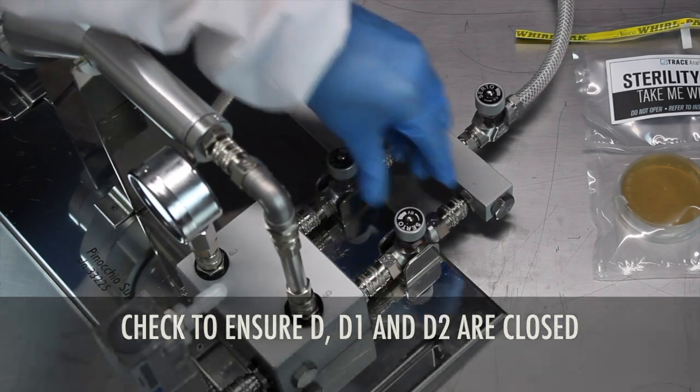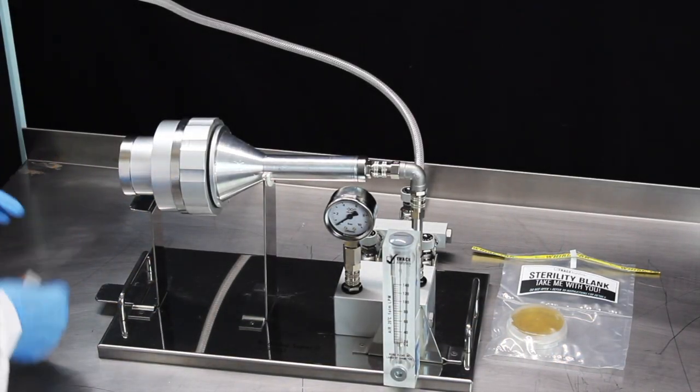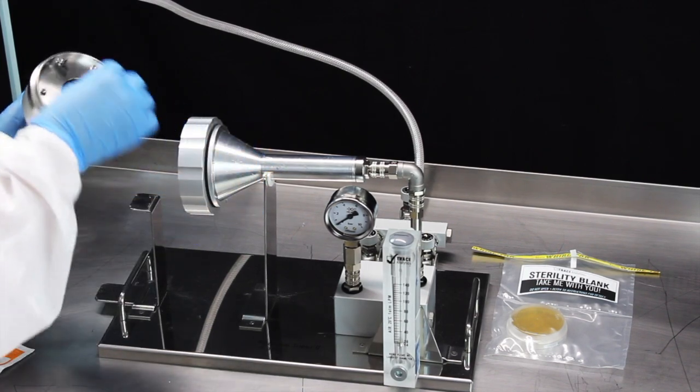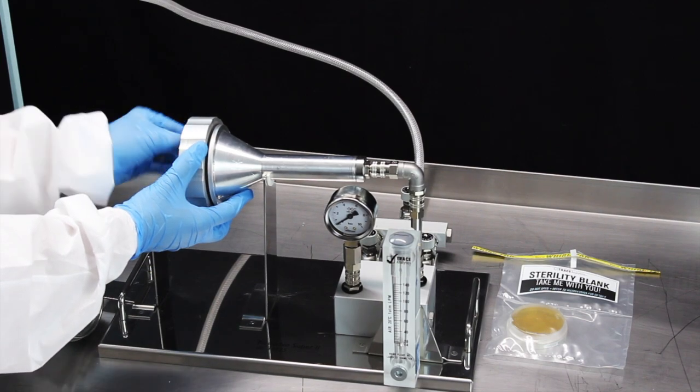With the air valves closed, unscrew the contact plate housing from the collar. Using the alcohol wipes provided, wipe down the inside of the plate housing and the inside of the collar. Allow 2-5 seconds for drying.